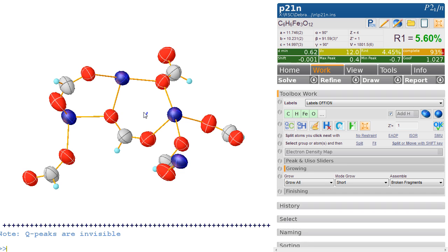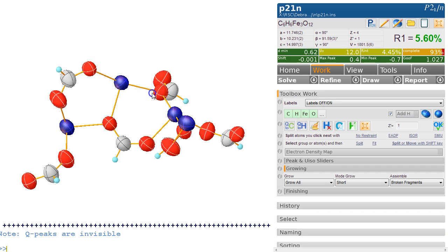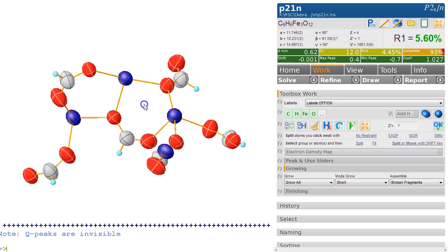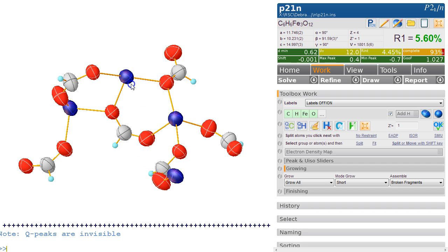But other than that, I think I've shown you how to get to the structure by a standard solution: electron density assignment and chemical knowledge put in there. I'm not saying this is necessarily iron—it could be cobalt or nickel. We don't know what was put in there.